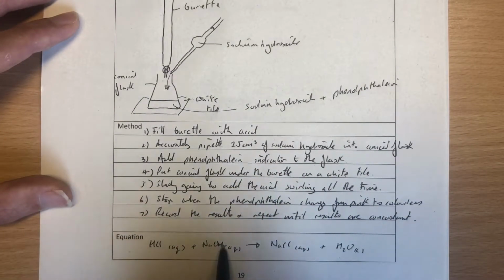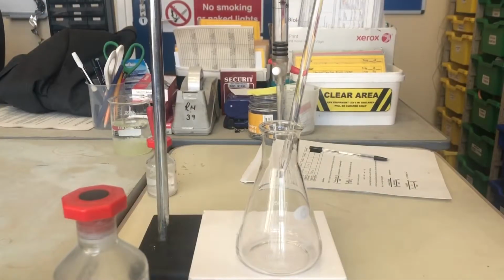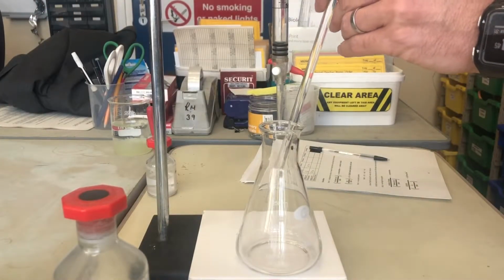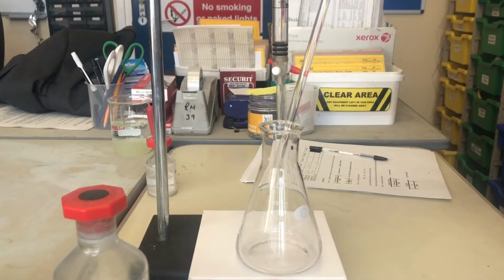One hydrogen there makes 2. That's the 2 hydrogens there. One oxygen, one chlorine, one sodium, one sodium. The equation is balanced. So what we're going to try and do here is a titration, an accurate titration to determine the concentration of the sodium hydroxide.